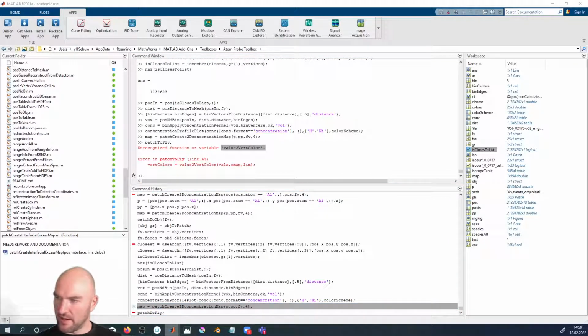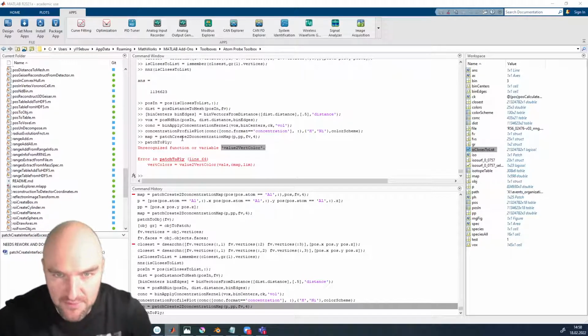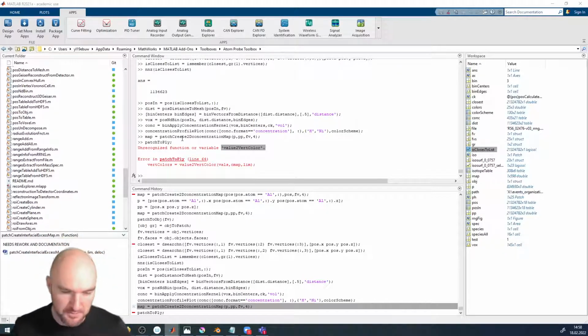Sorry that there were a couple of issues, but we are going to resolve that and merge that into the toolbox in the next coming days, because these are all really minor things. Being able to select vertices when you create a proxigram, or being able to split your data set up by vertex groups, are really minor things that don't take a lot of time to implement.